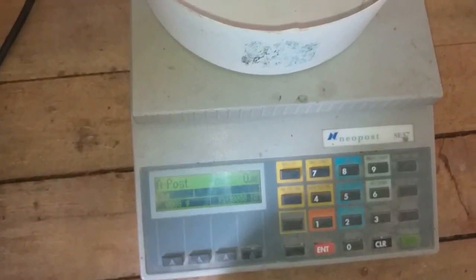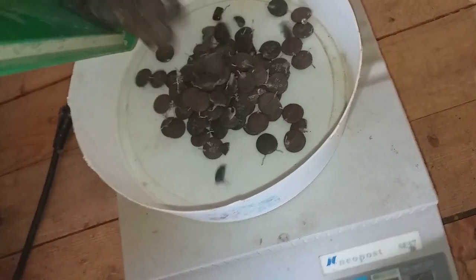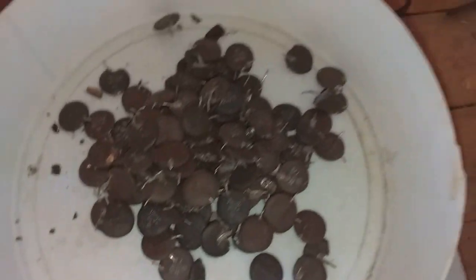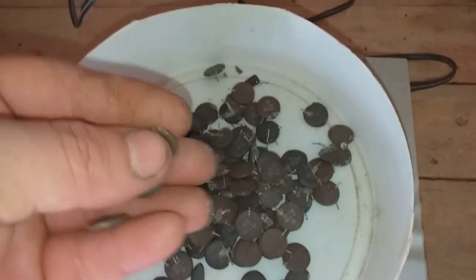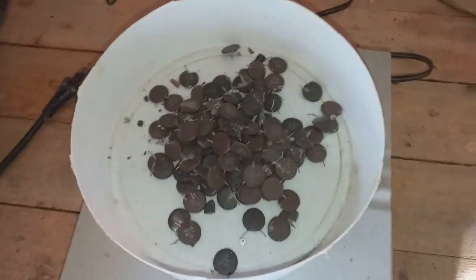Our scale is on zero - now let's see how much we got. I got 158 grams of this round brown capacitor. Let's burn that.